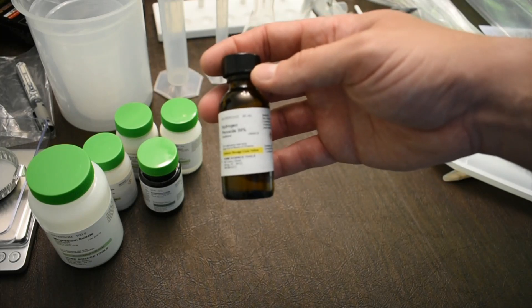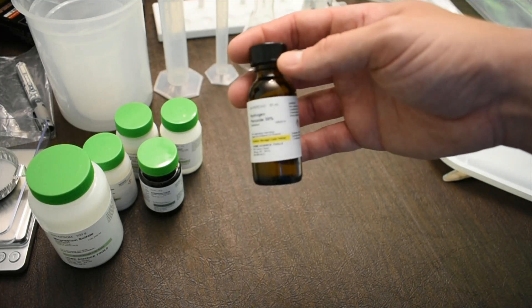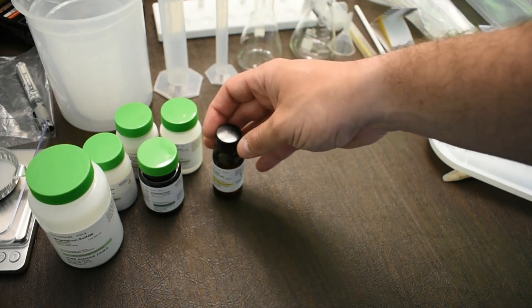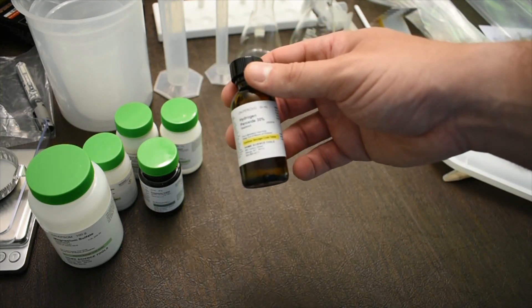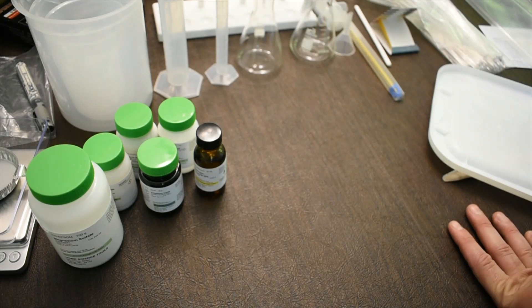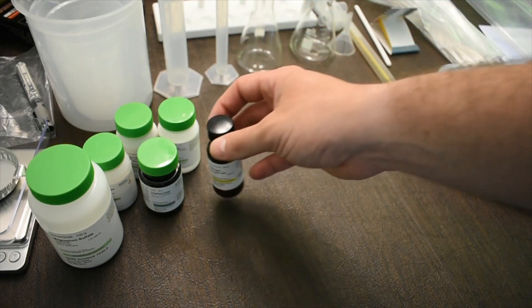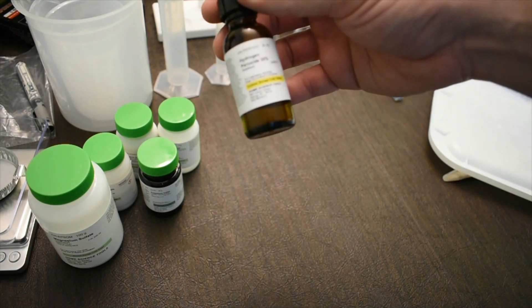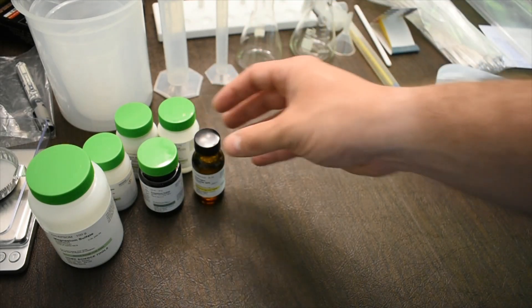The last chemical is hydrogen peroxide. The kit contains 30% hydrogen peroxide — slightly more concentrated than typical — because we'll be diluting it down to 5% for experiments, and starting from 30% works better for dilution. If you spill it, wipe it up with extra water. Wear safety glasses, and if it gets on your skin, wash with soap and water.